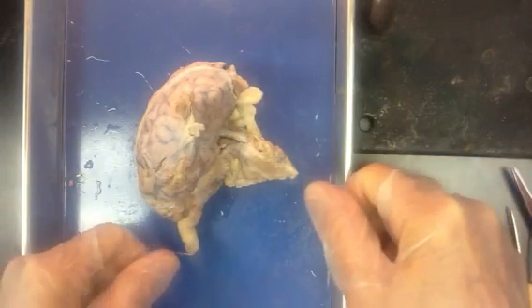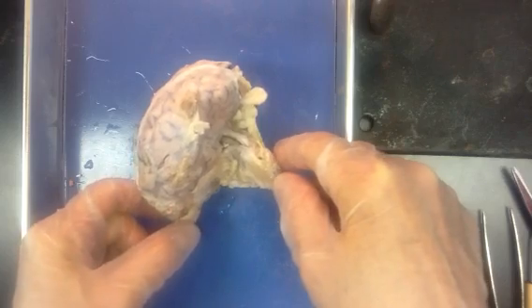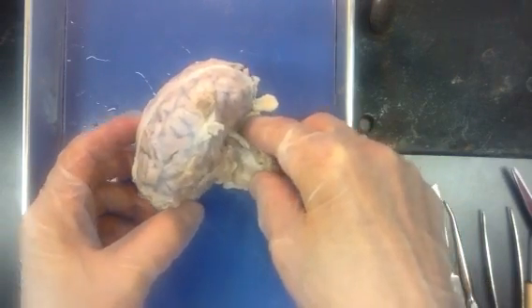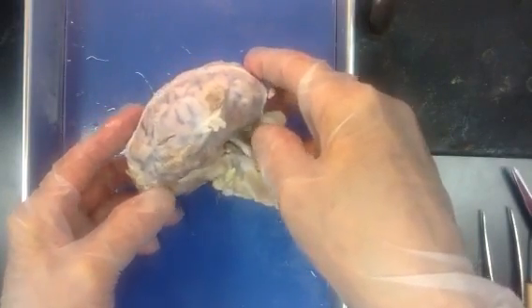Welcome to your introduction to the brain. We are going to use the sheep brain as a stand-in for the human brain. You'll see there are very many similarities, a few little differences — basically size. You can notice it's quite a bit smaller.